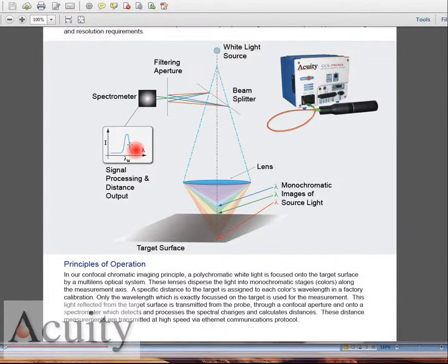It goes into a little filtering aperture, a little pinhole, and then we have a white light spectrometer in here that is measuring the wavelength or the color of the light coming in. Based upon that color, we have it linearized to give a displacement.